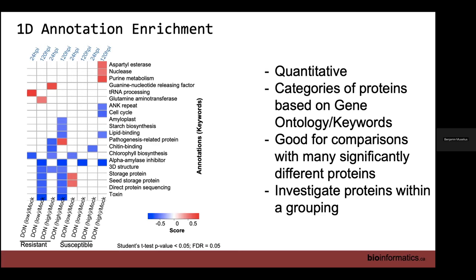Another consideration is on volcano plots, you may not have any significantly different proteins. That's always very disappointing. You map your volcano plot and there's nothing that comes up as different. This is a way to get around that. Sometimes you can look at the category of proteins and you can see enrichment that can give you something to talk about. So we will do this oftentimes with collaborators if they send us samples and then nothing changes or it's not clean enough for us to see individual proteins, but we can still work with the data. You can always do something with it. That's my motto.